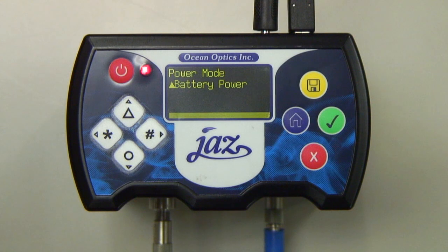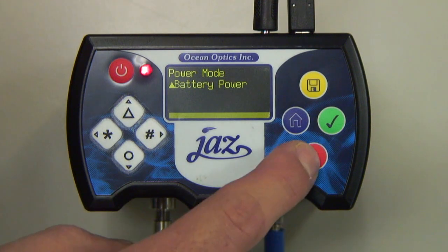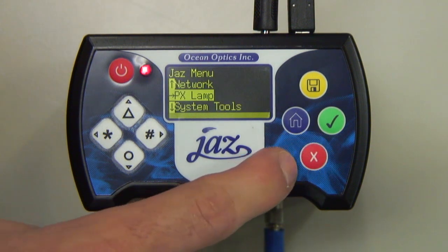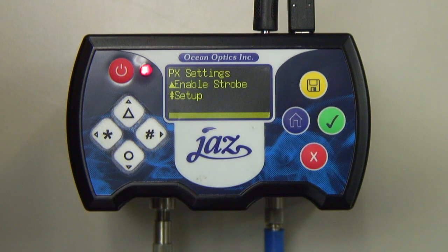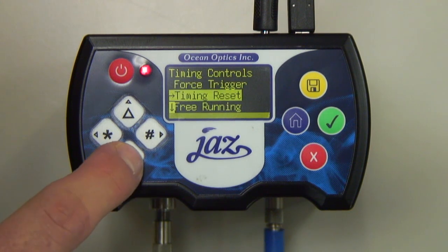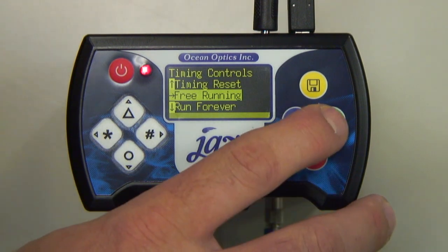There are two modes of operation for the Jazz PX. The first is Free Running Mode. While in Free Running Mode, the light source is not synchronized to any other element in the Jazz system. To access Free Running Mode, select the PX Lamp daemon, enter Setup, Timing Controls, choose Free Running Mode, and then click Enable.